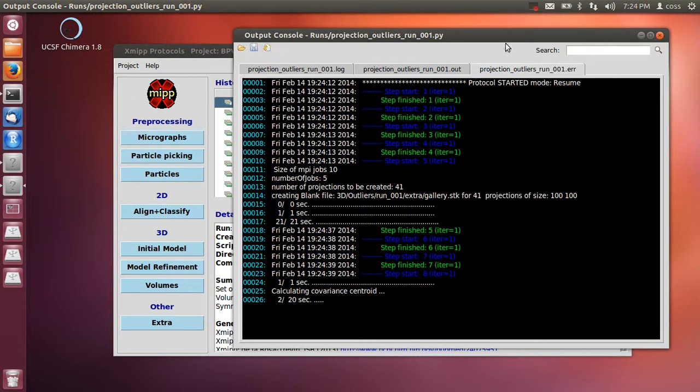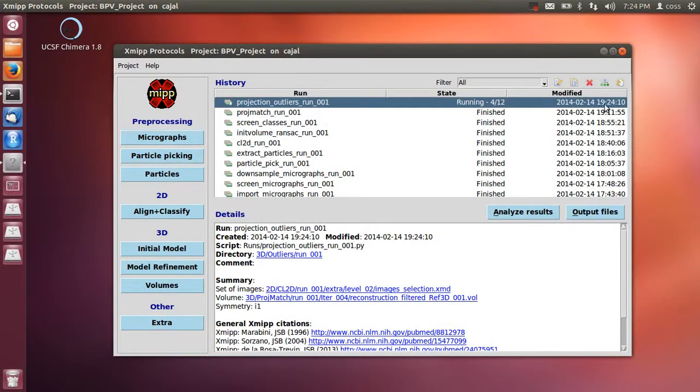And what we do here is to compute the residuals of those images. So you take your experimental image, you take the theoretical projection that corresponds to it, we compute the difference, and then we analyze that difference, and we analyze how normal that difference is with respect to the rest of the differences.